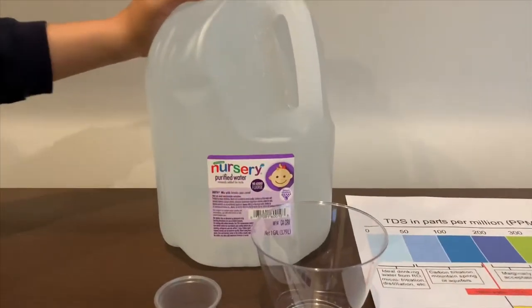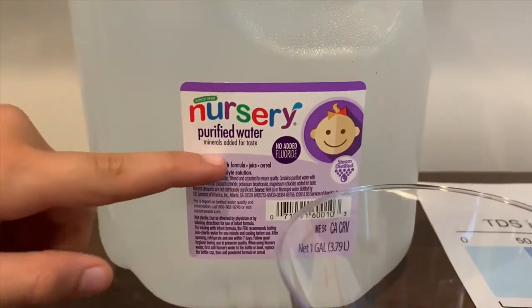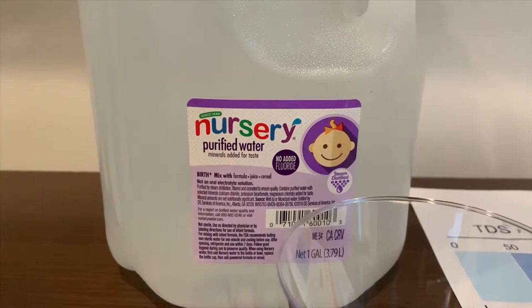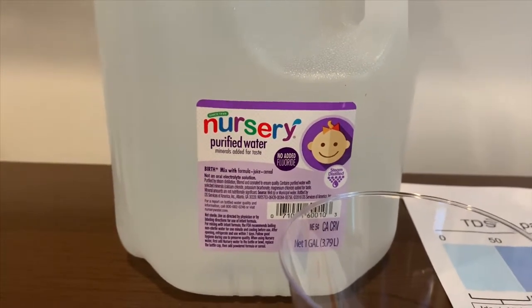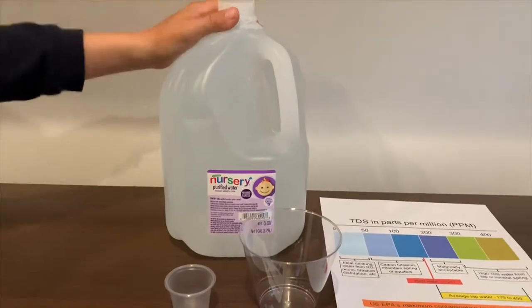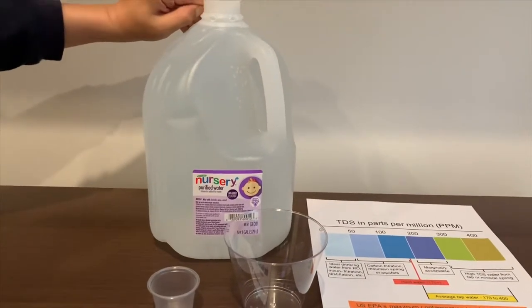This is Nursery purified water with minerals added for taste. It costs $1.49 and it's sourced from wells or municipal sources. Let's test the TDS and pH levels.